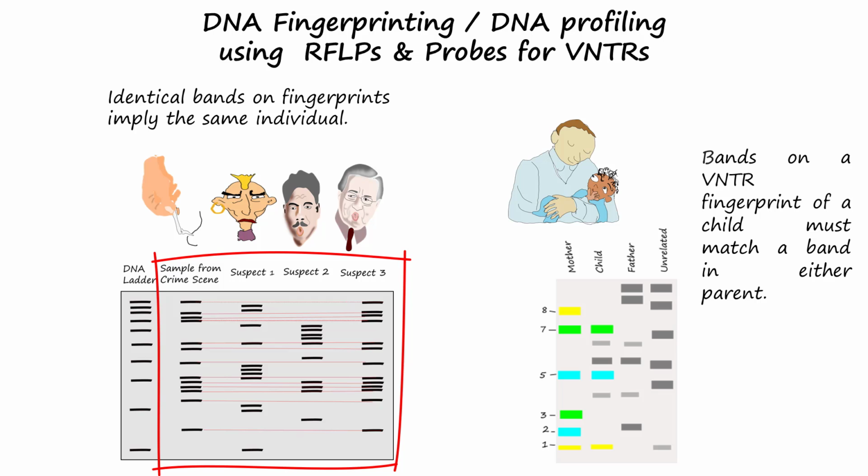In identification, even if one allele at one locus is different, it can be concluded that the DNA is from separate individuals. Related individuals will have some bands in common, inheriting the same DNA variation from common ancestors.